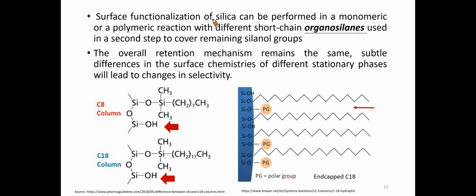However, there may be some bare hydroxyl groups on the silica, which may cause undesired secondary interactions with the analytes, and those result in peak tailing. To resolve this potential issue, some manufacturers further modify the uncoated hydroxyl groups to avoid secondary interaction. This is an end-capped column.